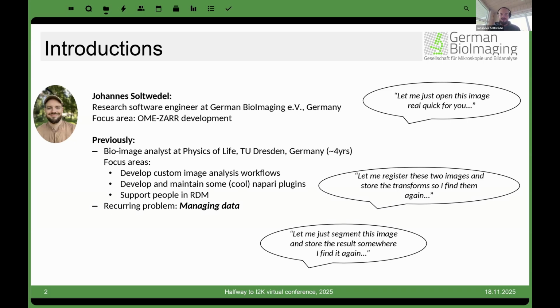And this problem really came in very different forms. Sometimes images were just really, really big. So simple things like wanting to show or collaborate on an image were really hard because people would have to install plugins, get something started, whatever. In my PhD, I had to do some image registration, which is typically a problem where you have two images, image A and B, a moving and a fixed image, and you want to warp the moving image so that it overlaps with the fixed image in a particular way.